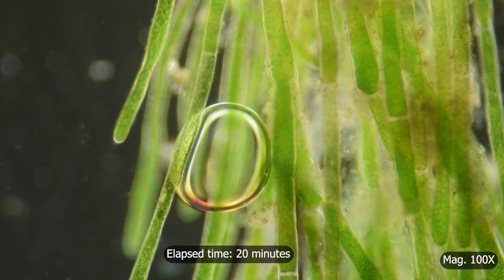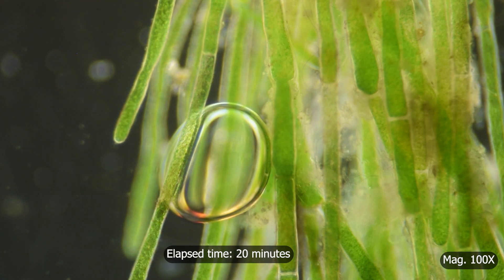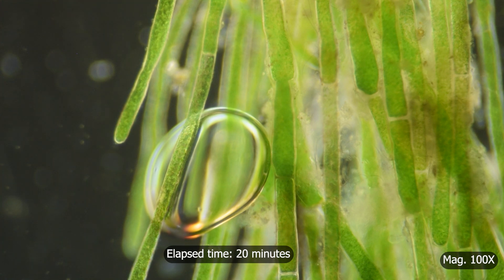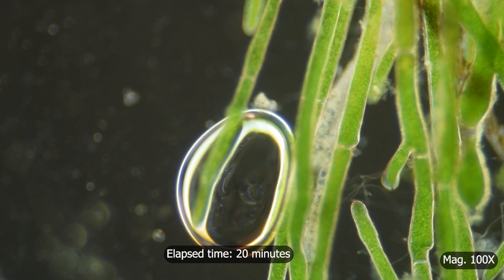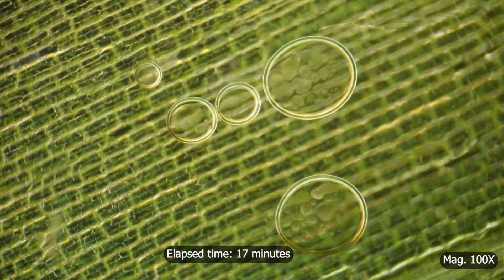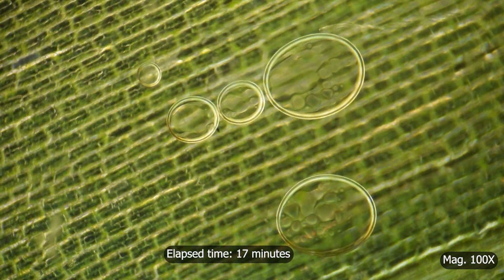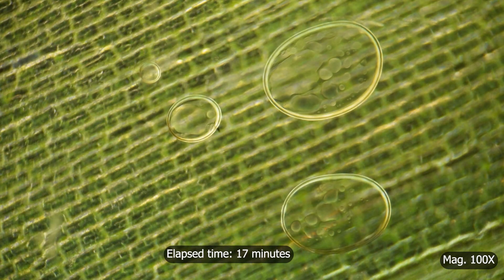If I speed up the footage, oxygen bubbles can be seen growing as photosynthesis takes place. Plants and algae turn carbon dioxide and water into oxygen and sugar. I was able to demonstrate photosynthesis powered by my microscope light.